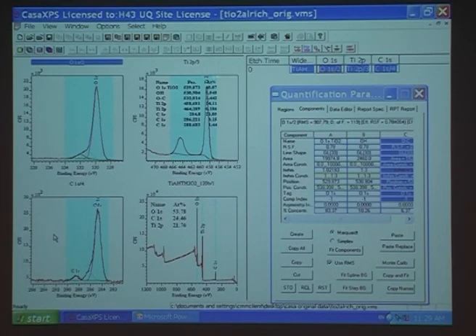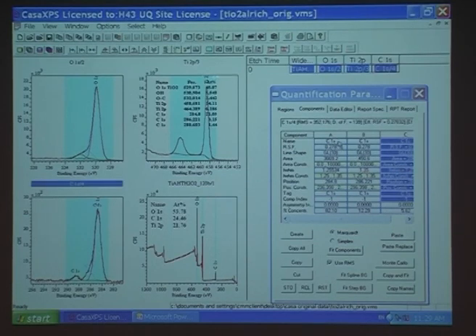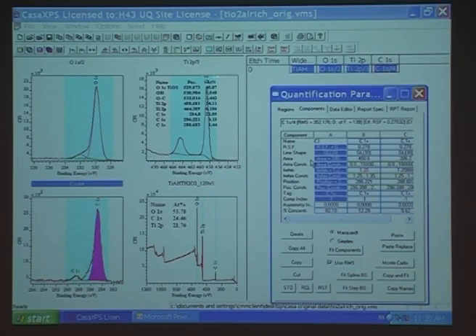What I've found out is, yes, machine's working good. I should be using 284.8. I can come in here and I better label that, that's the carbon reference, enter. And I tend to just print that out then and keep it. Because I then say, okay, use that for the reference, and this came in nice.